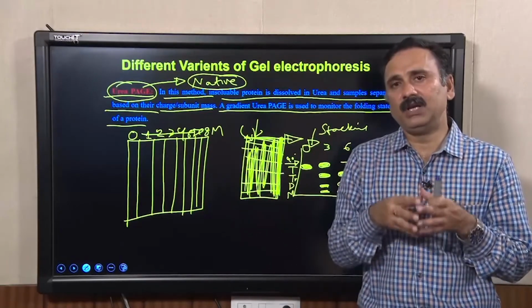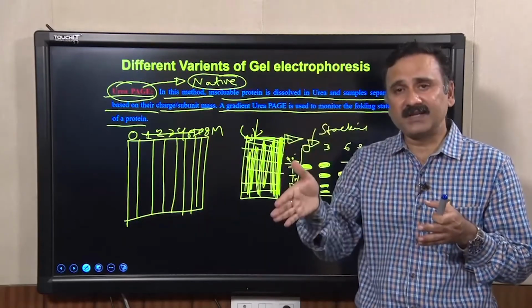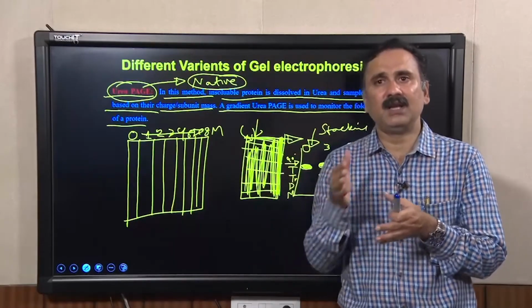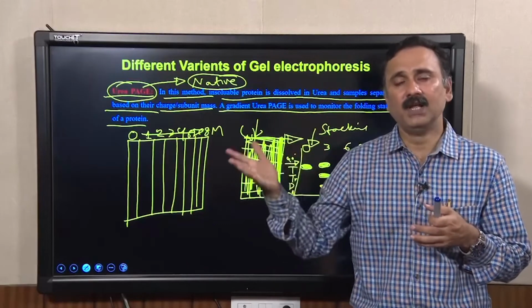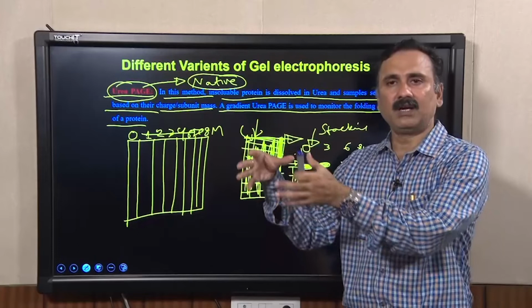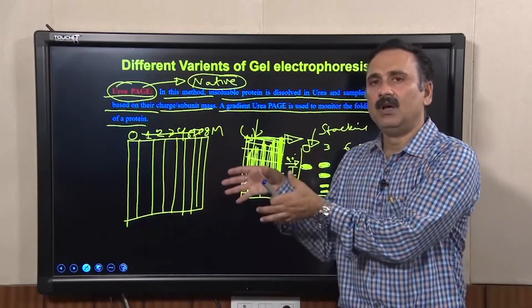So, it will tell you which oligomer is going to be broken down, at what step the protein is losing its 3-dimensional structure, and at what step it is losing its interaction with the neighbors, so that the tetrameric protein is getting converted into trimeric, dimeric and monomeric, and ultimately everything will get converted into the monomeric.